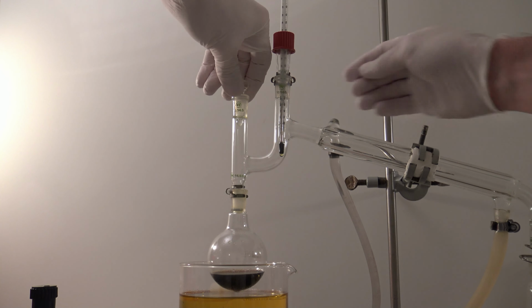To determine the boiling point, some of the oil was added to a test tube with some boiling stones and a thermometer was placed above it. After that it was heated with a heat gun until the oil began to boil. It didn't reach high enough, so the thermometer was placed lower. The discoloration showed that the compound either reacted with air or did simply decompose. The highest temperature was at 213 degrees C, which was way below the literature value, but could be caused by a lot of reasons. The value was at least above 200 degrees C.